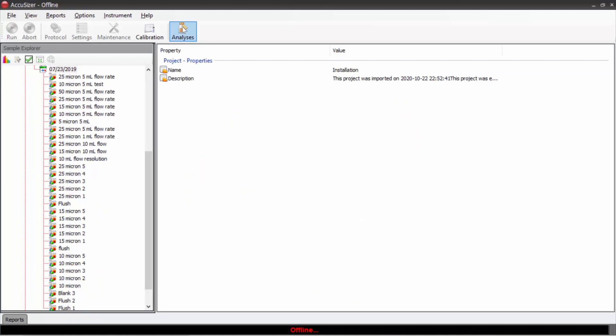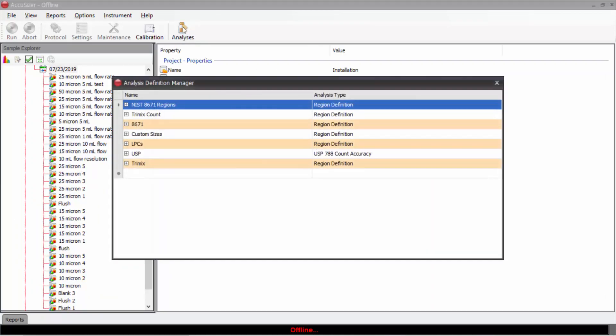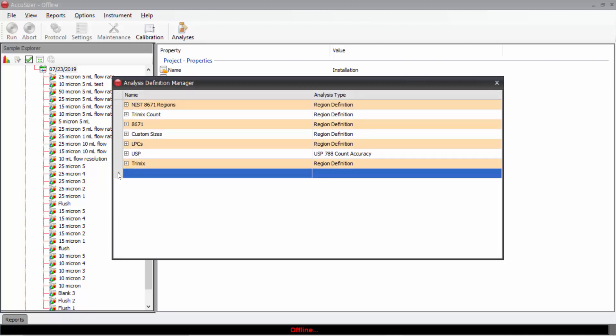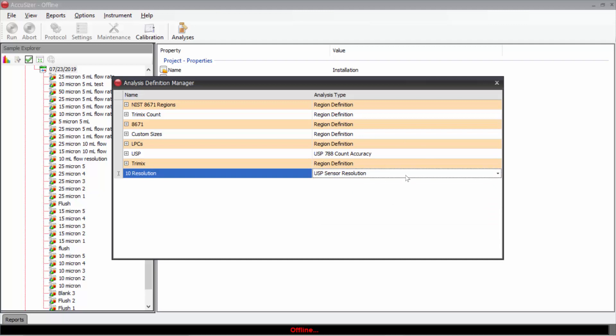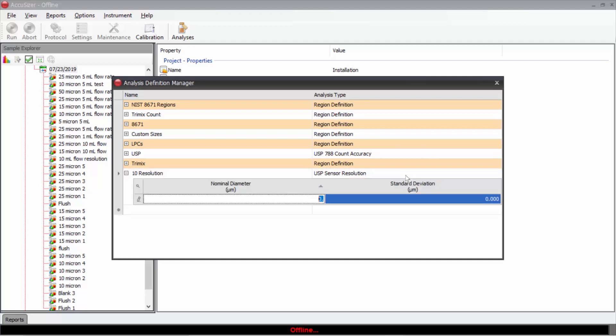Let's do a few more analysis regions. If I'm doing a USP 788 validation, I might want to enter information for the 10 micron resolution test. Over here under the type, I will select sensor resolution. Hit tab.